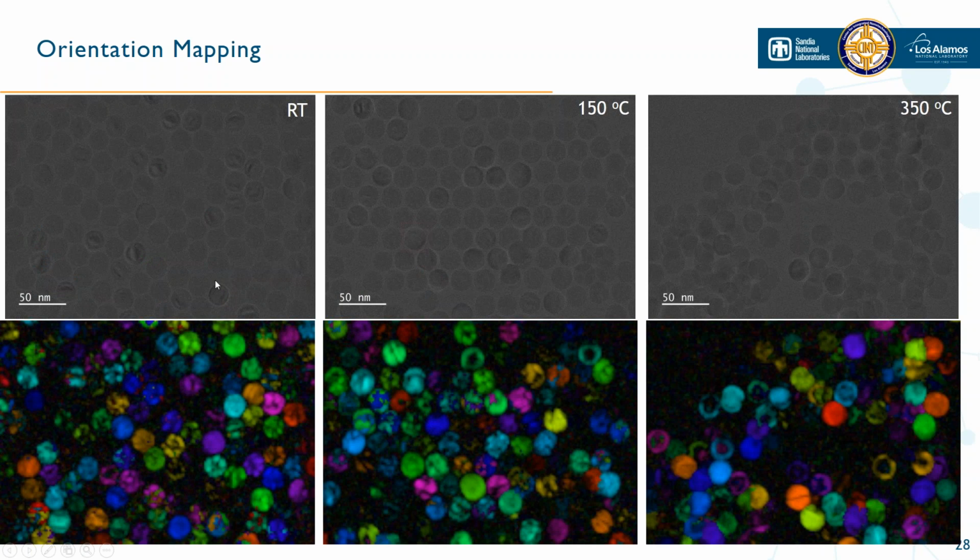So we can apply this to a number of different experiments. These were oxidized ex situ, and we're still trying to understand this data, but you can see that these are fairly low dose images, and you're still able to extract this information from each individual nanoparticle, and we can start to see some differences between the low oxidation and the high oxidation. So we're super excited to delve deeper into this data.